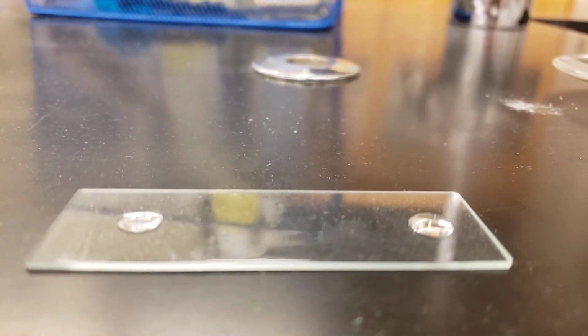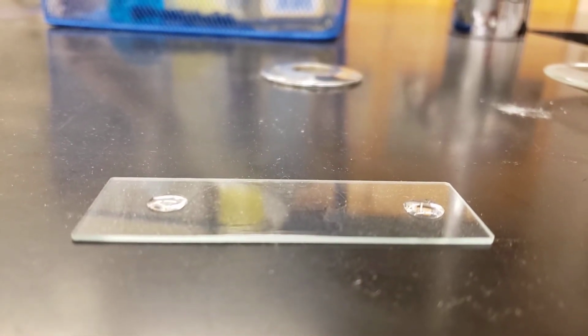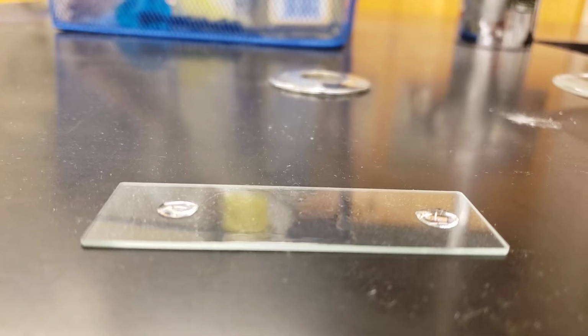To compare a side view, we can't see our isopropyl alcohol basically at all. Our glycerin droplet on the right side is still standing up, and the water has spread out slightly while still standing up.